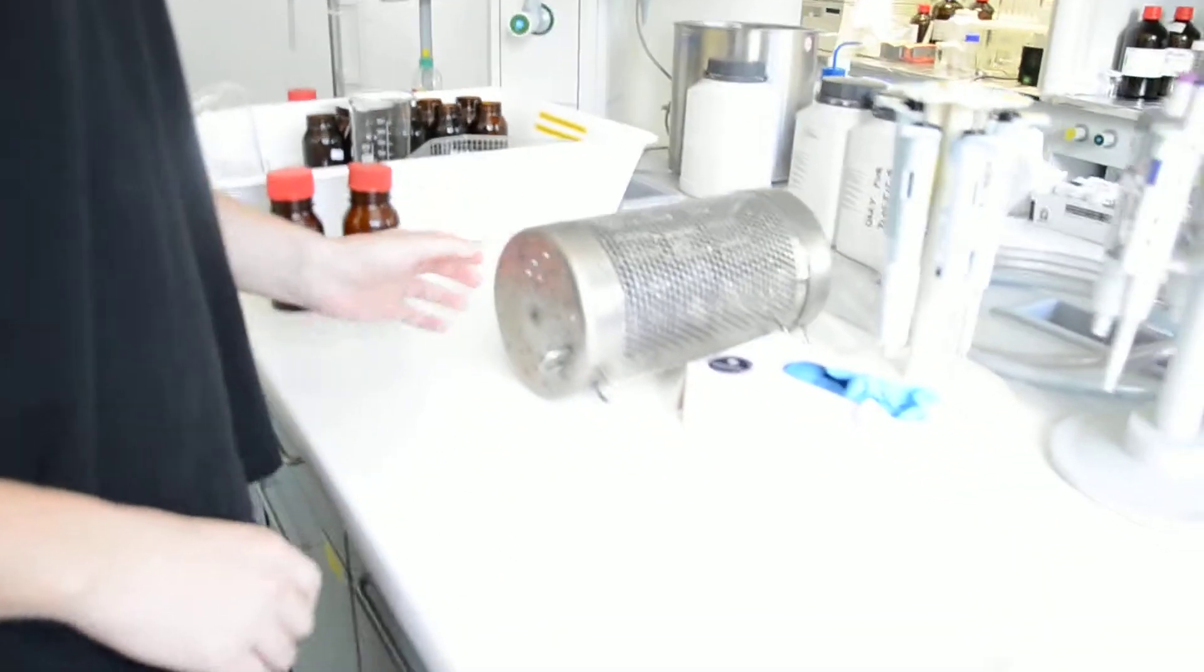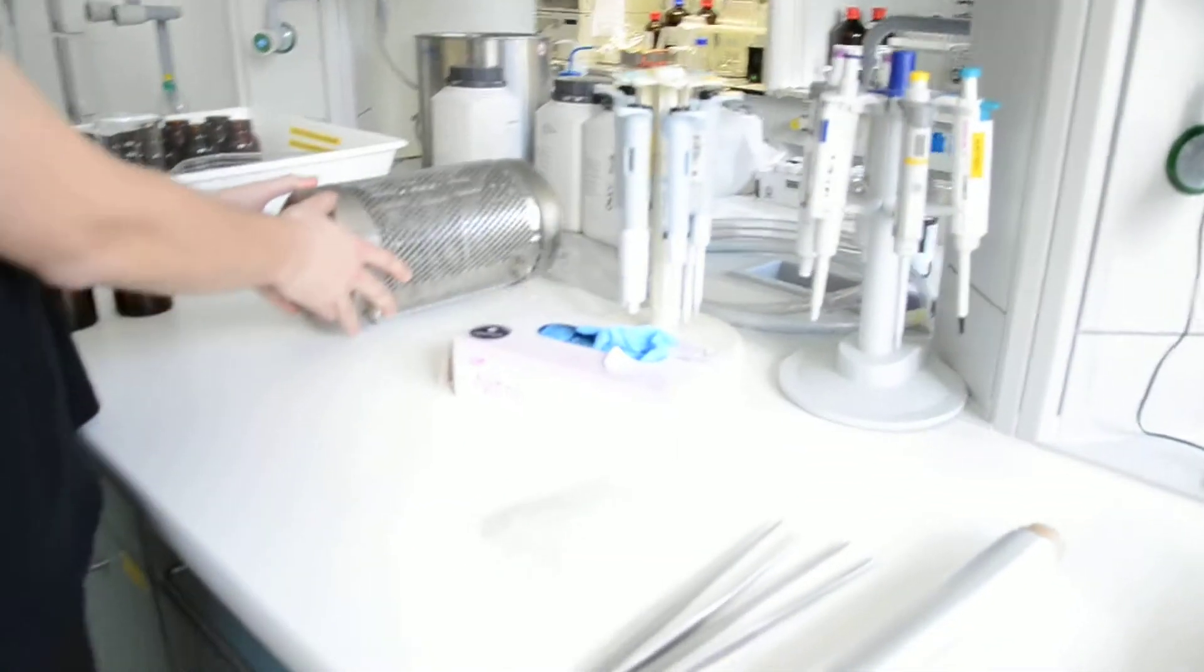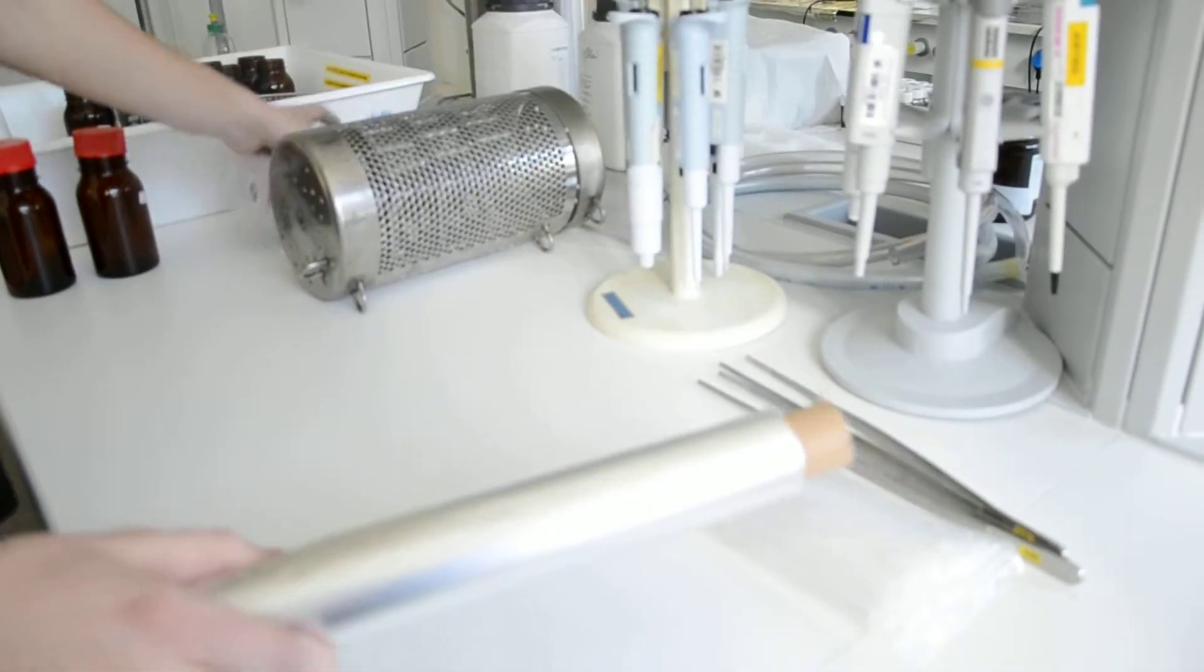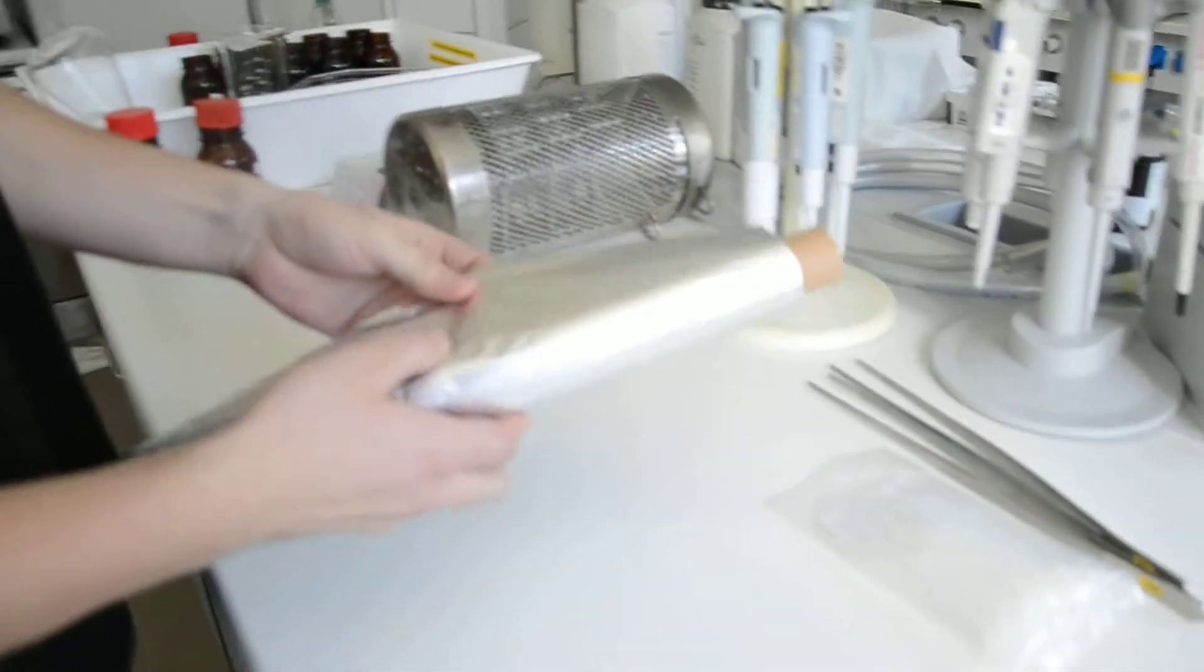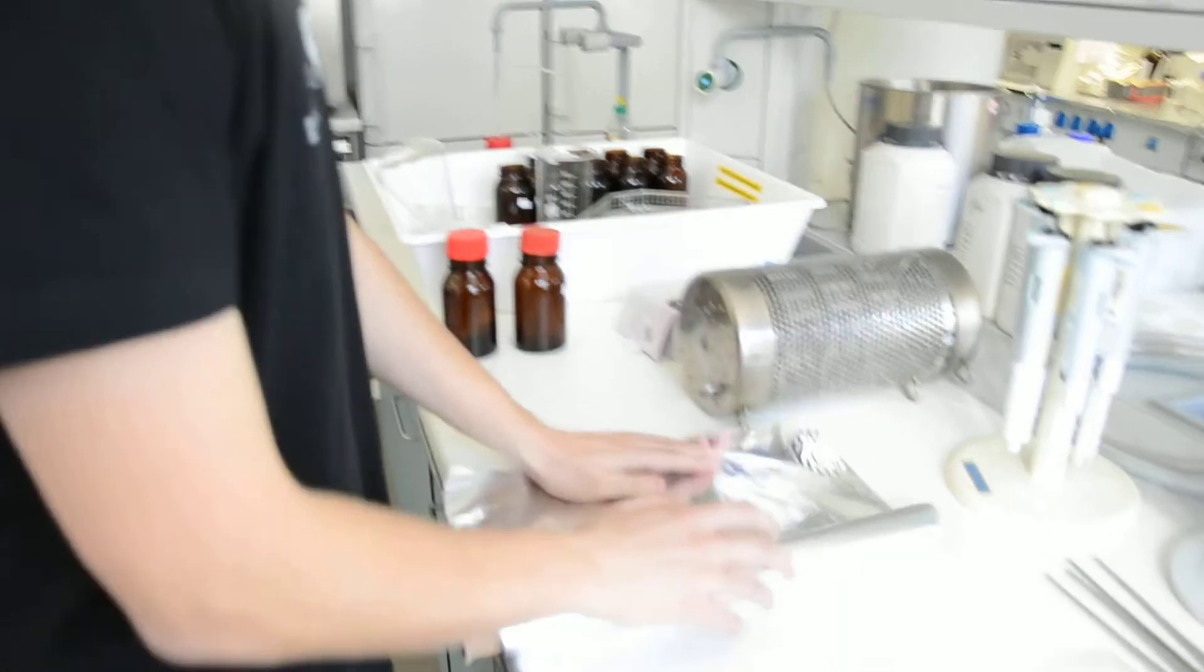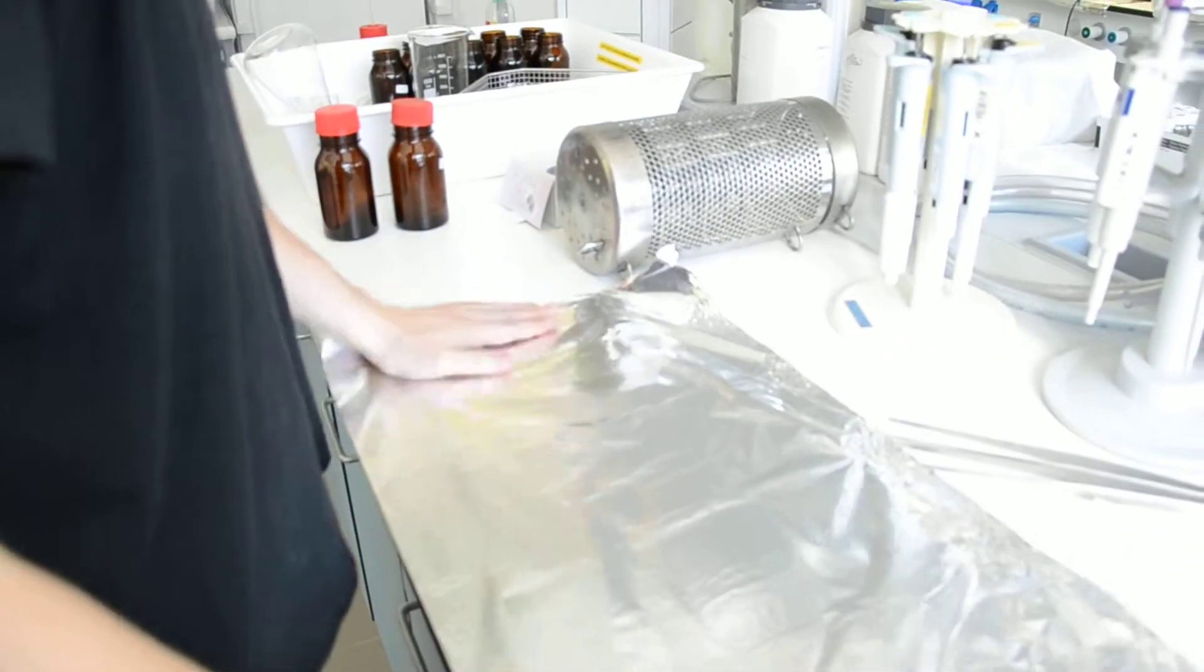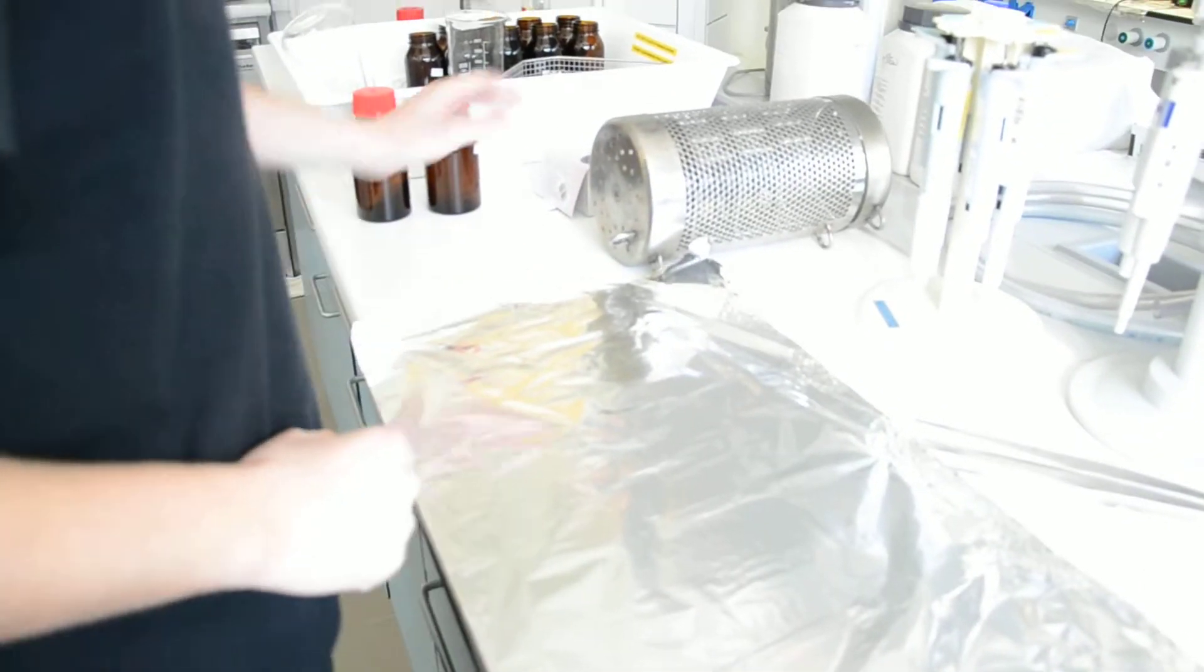First, we will start by preparing a clean surface. We take the aluminum foil, we can make surface like this and we open the cage. It turns like this.